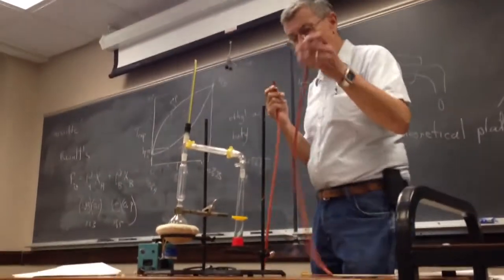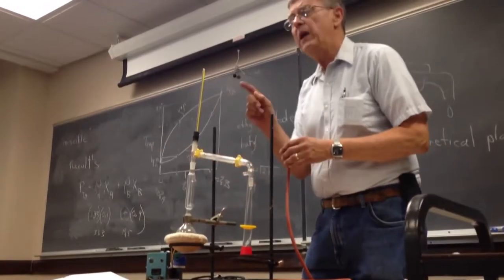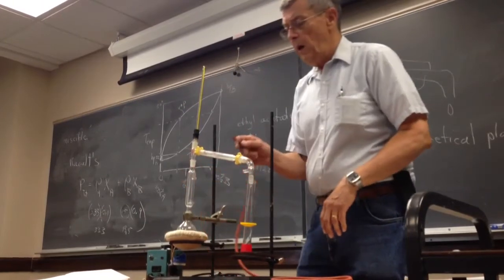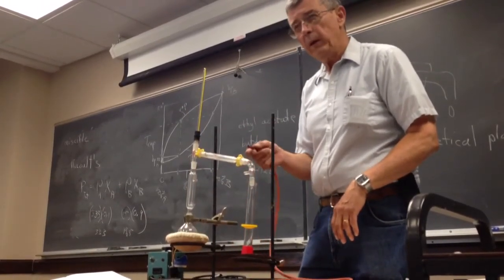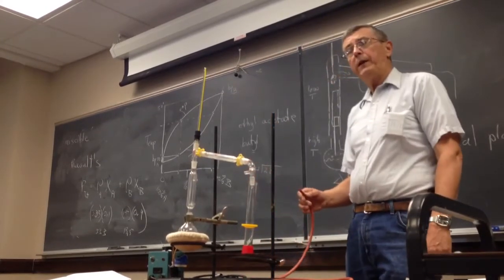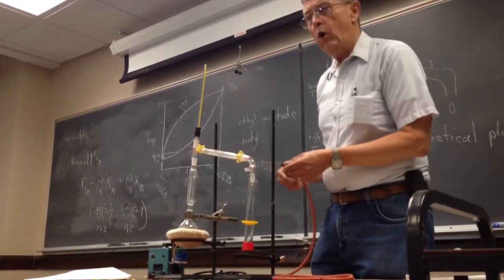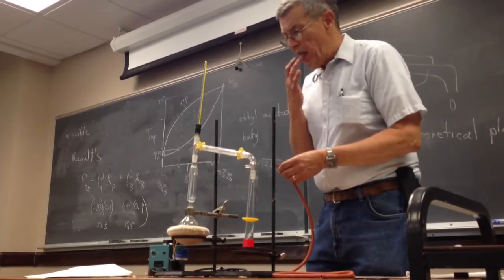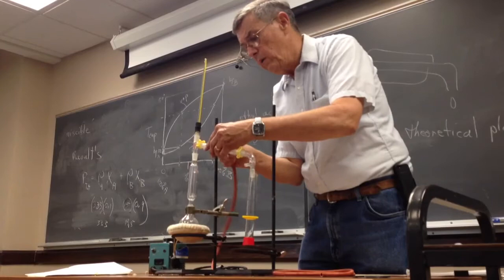It goes on. The best way to lubricate this is not with stopcock grease, because it's going to go on one of these little things, right? It's not with stopcock grease, because that'll permanently sit there. If you get pressure, it'll blow it right back off because it's greased. Instead, what you want is a little bit of water. I don't have any water. That's my tea. Spit is probably the best lubricant for it.